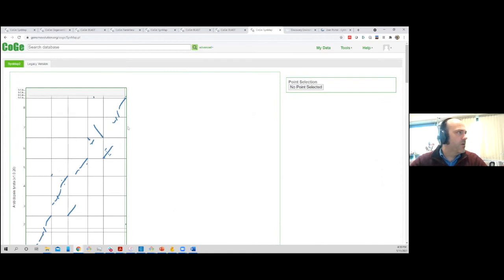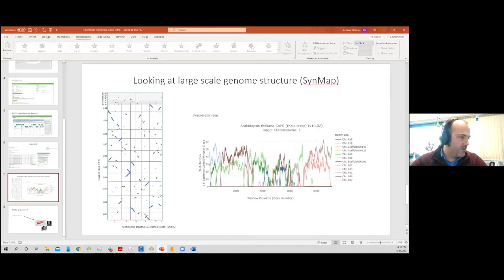Okay, so let's see, did I cover all the important bits? Yeah, I feel like I went through that quickly, but you can BLAST, you can look at genome evolution, you can compare between species, you can make your genome public, you can make it viewable by other people.